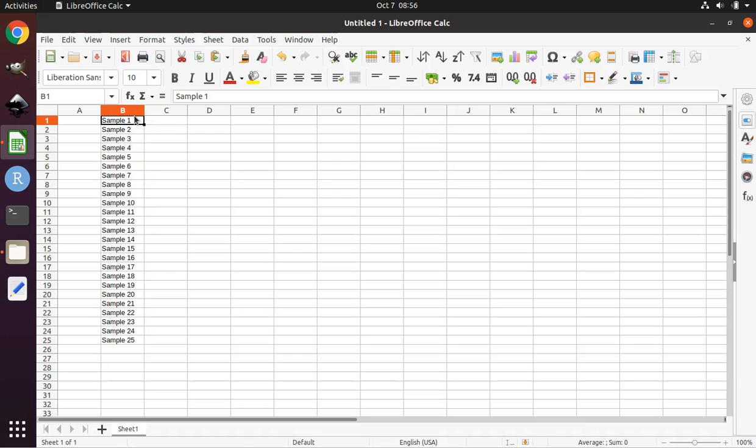Now, in this tutorial, the names of my individuals are sample 1, sample 2, sample 3, etc. These are the individuals for which we have genetic data and for which we have spatial data. I'll describe the spatial data momentarily. With your actual data, your individuals have some name that's whatever you assigned them when you originally set up your genetic data. So yours will not be called sample 1, sample 2, sample 3, etc.